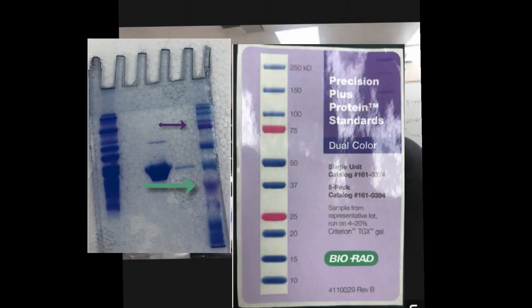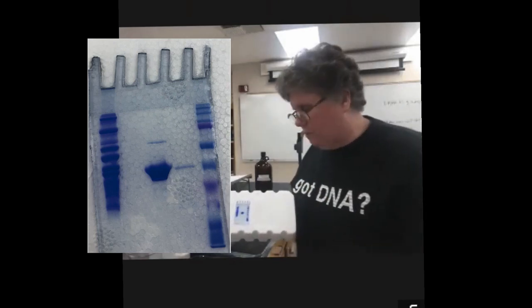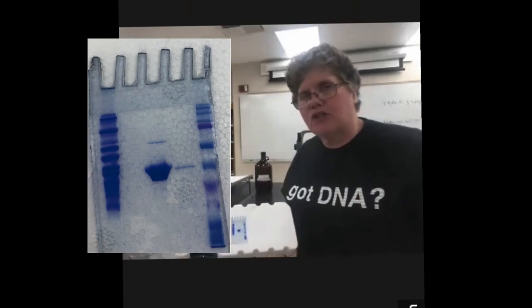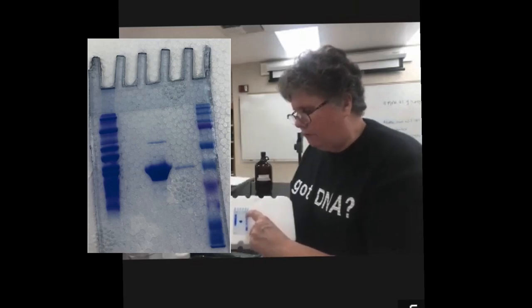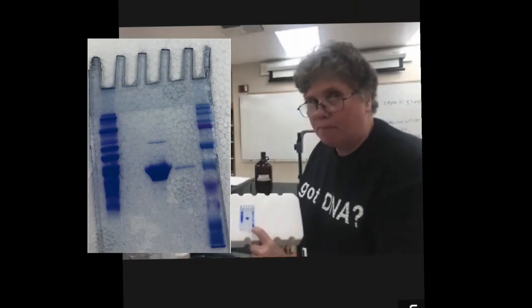So you have the two pink bands at 25 kD and 75 kD. And in between, you have the other sizes on the size markers, and you know what size they are because the picture of the markers tells you what sizes all of these known bands are going to be. So what you want to do is measure from where they entered the resolving gel, not where they entered at the top of the lanes right there in the stacking gel, because everything's stacked up together, but where they entered the resolving gel. You can measure each individual lane from where it entered to where it is, divided by the furthest that anything went, to the very, very bottom down here.